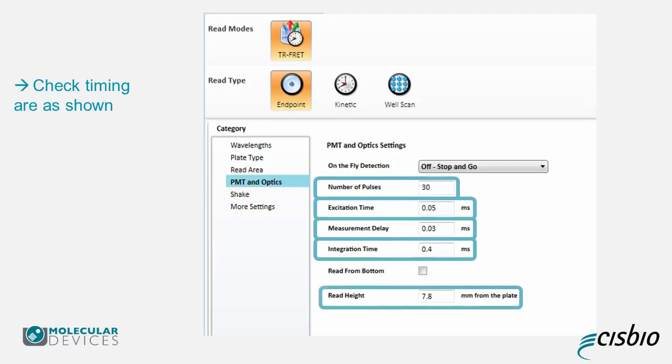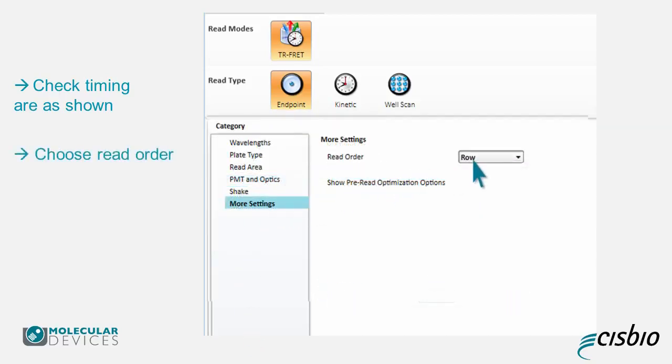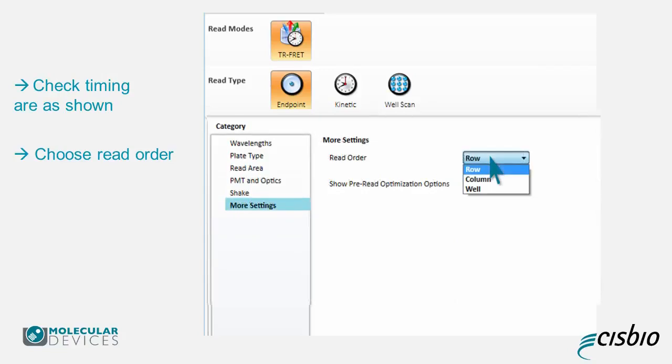The read height will be optimized later. Finally, click on More Settings and choose the read order. Note that the reader will read the whole row if you select Row Order, including the wells not included in the read area. Make sure you choose carefully in order to reduce your reading time.